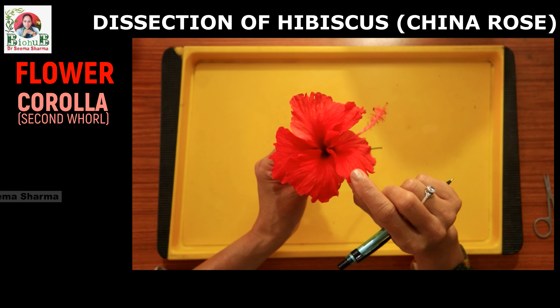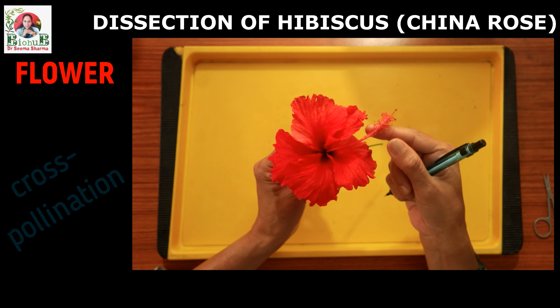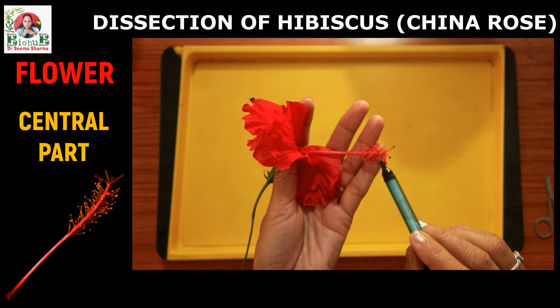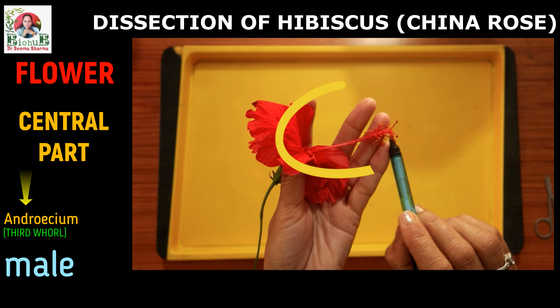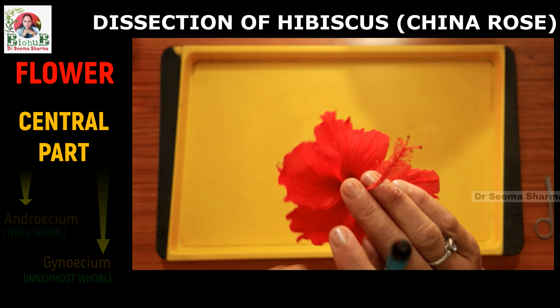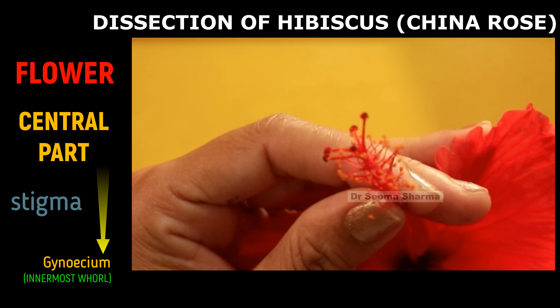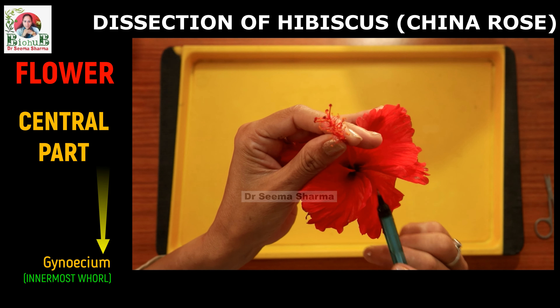The main function of corolla is to attract the pollinators for cross-pollination. After corolla comes the central part. This central part of hibiscus houses the essential reproductive whorls: androecium and gynoecium. Androecium, which is the male part of the flower, is made up of a long red colored staminal tube bearing an infinite number of stamens on its upper part. The innermost whorl, the gynoecium, lies within the staminal tube; however, its stigmas can be seen jutting out of the tube. Both these parts will be explained in detail while dissecting the flower.